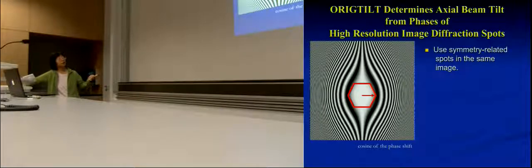Let's say we have this pattern in there. As I said, it has a directionality to it. This is the direction of the tilt, so I have this effect. If I look at the direction that's perpendicular to it, then it's always 1, so there is nothing in the correction. So I have a diffraction pattern sitting on here with that effect. Then these three points that used to be related purely by symmetry are no longer going to have the same value. You will have a bigger shift here and less shift there. As a result, those symmetry-related reflections no longer have the same value.